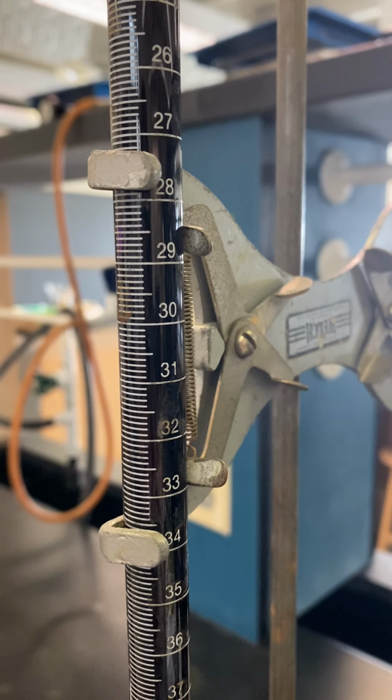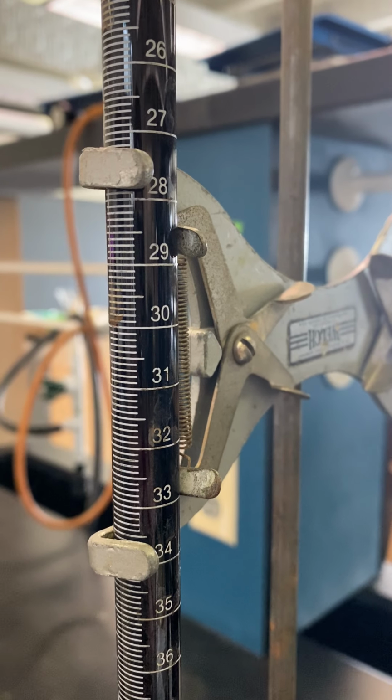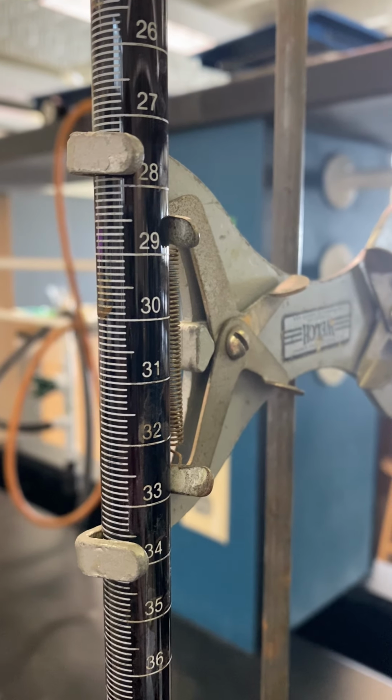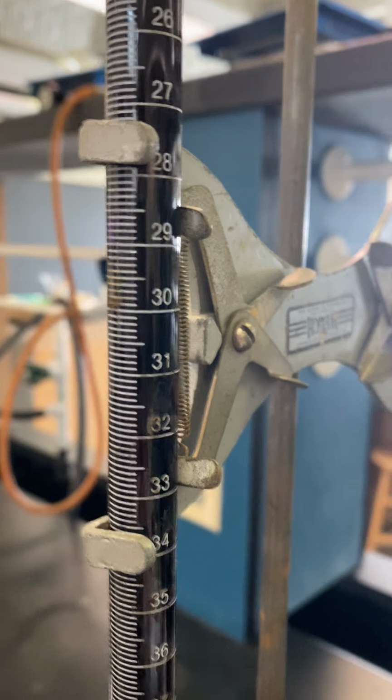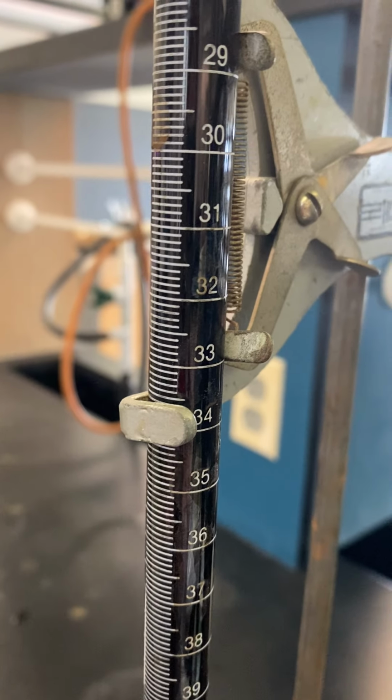Okay, so it is precise to the 1/10 of a milliliter, which means we must record our volume to the 100ths of a milliliter, 2 decimal places.